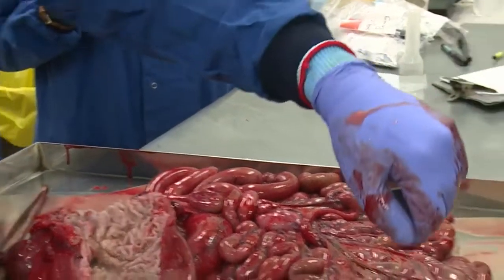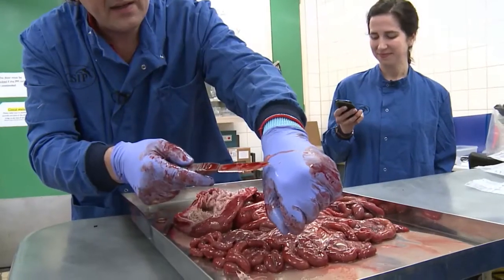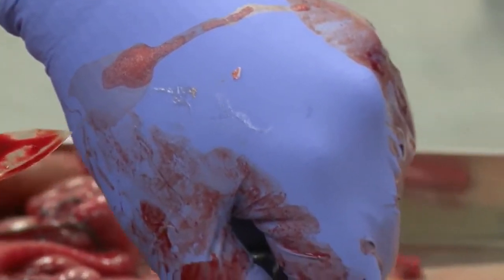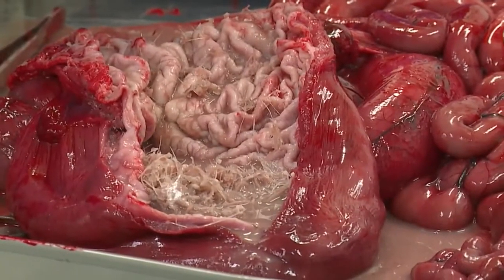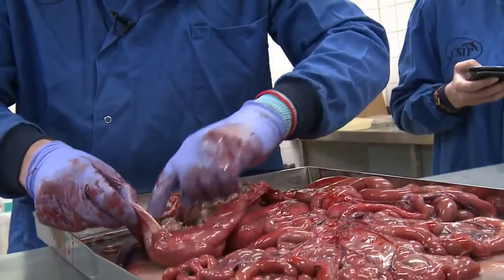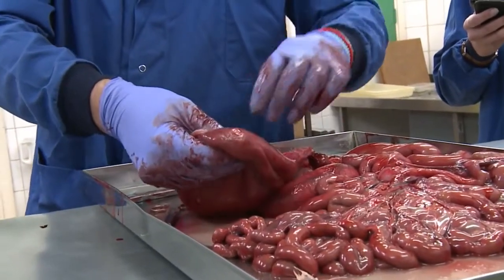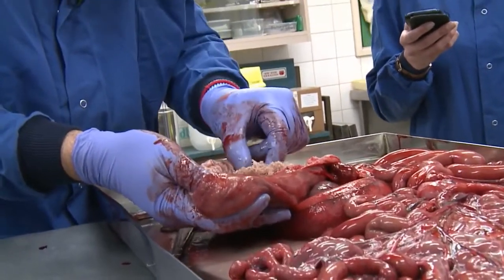So, back of my glove, that kind of whitish bone just here. This is one of the otoliths. So they're diagnostic to the kind of prey species. Each fish will have different kinds of otoliths, and we can identify what they've been feeding on from that. So put that back in, have a little poke around. We're looking for any evidence of ulcers or parasites, and pertinent to one of the last questions, plastic. So there is no plastic in this animal that I can see.